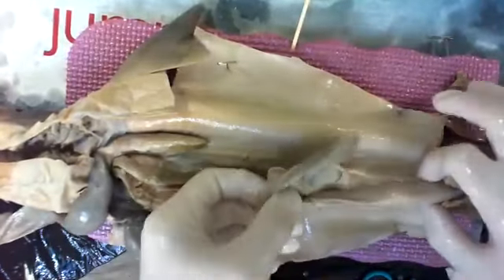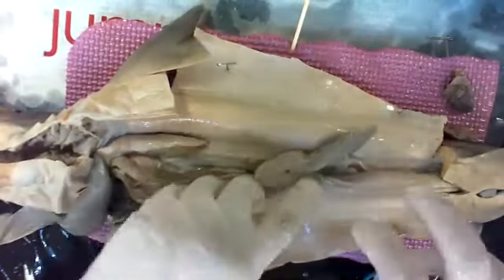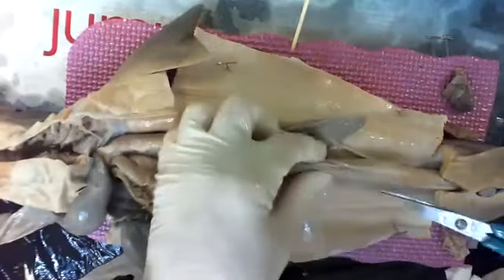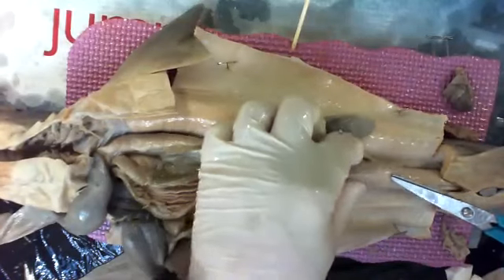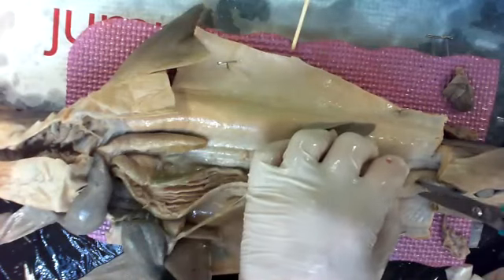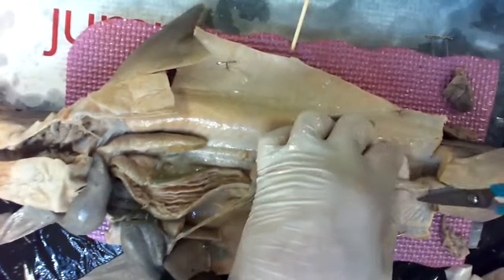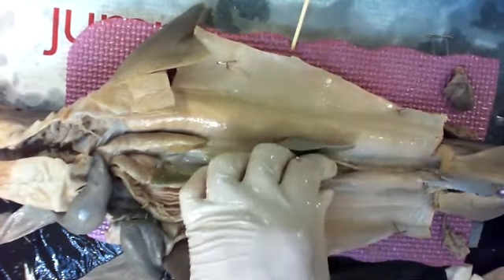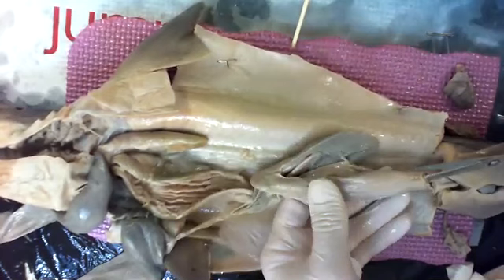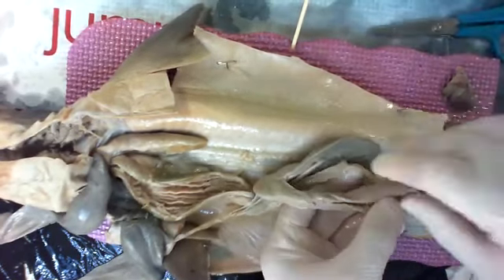Here's the whole intestine. That's it. There's no small intestine and large intestine. It's just intestine. In fact, it's called spiral intestine. Can you see it? It's like a wasp, how it has the lines on it. So we'll cut this open, just like we did the esophagus up there. Pinch, cut, cut, cut, cut. Now I'll go into it and cut again. Cut, cut, cut, cut, cut, cut.